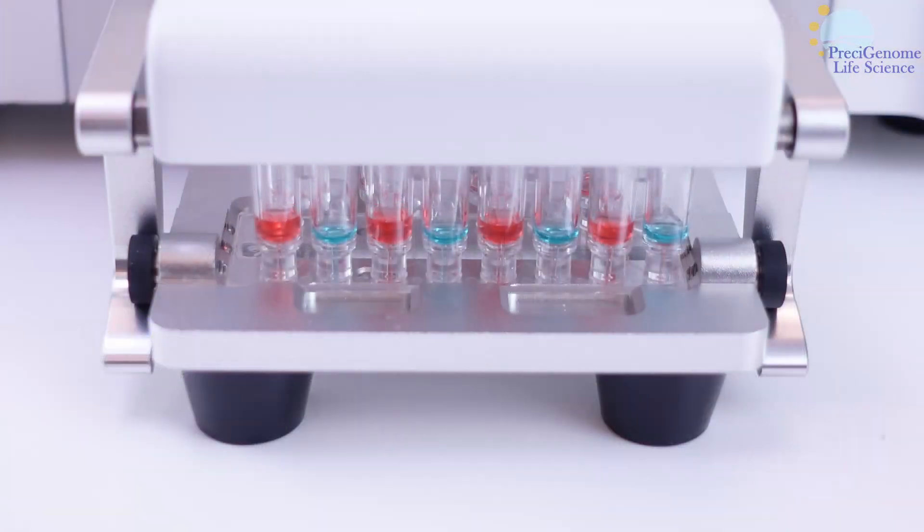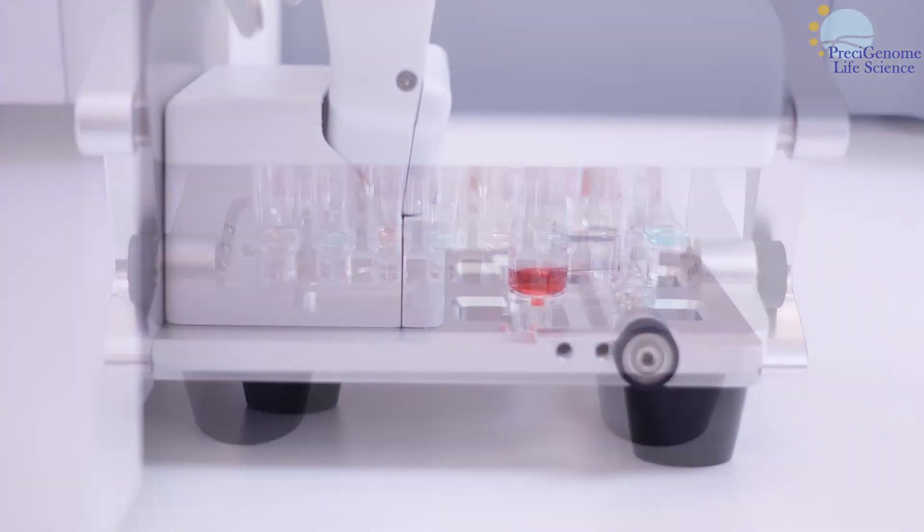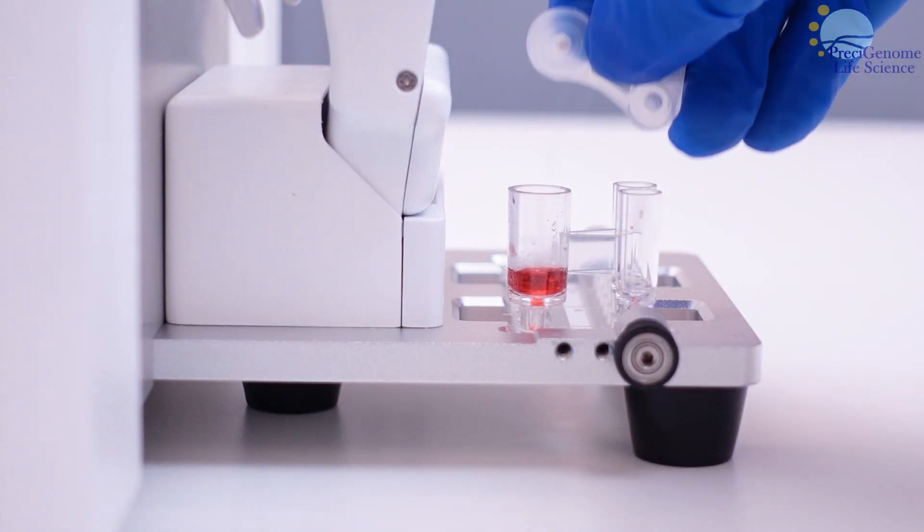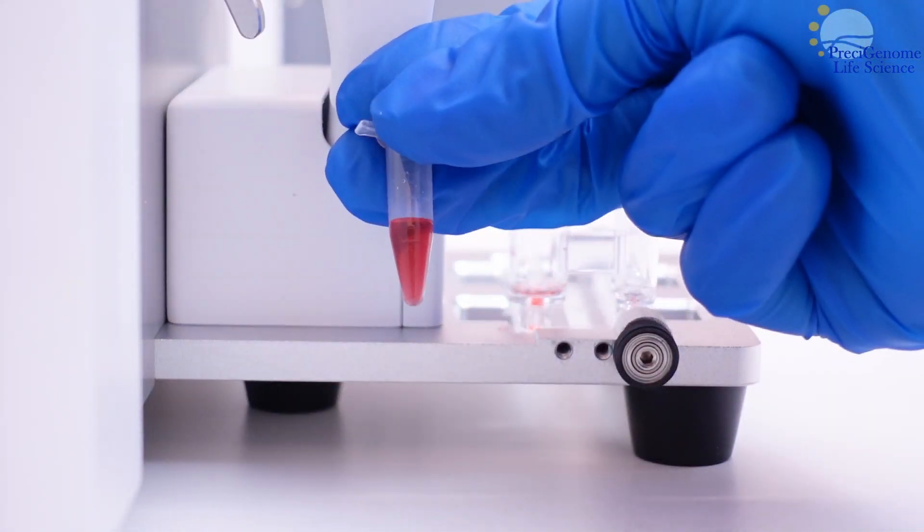A typical recipe will be completed within seconds. From here, you may collect your product for further analysis.